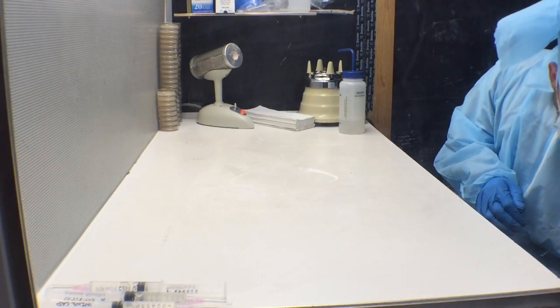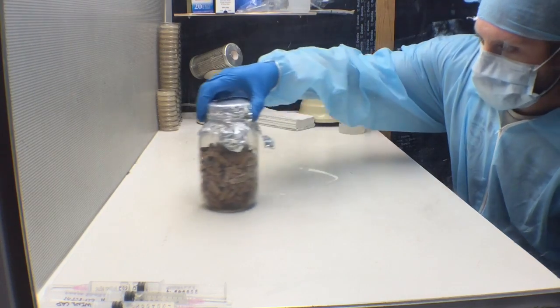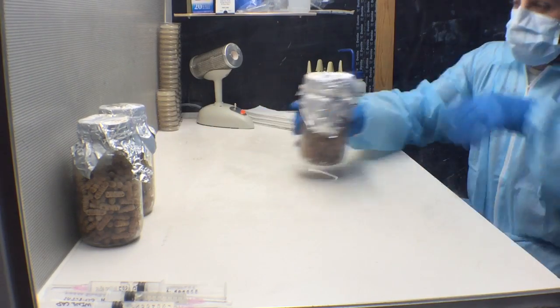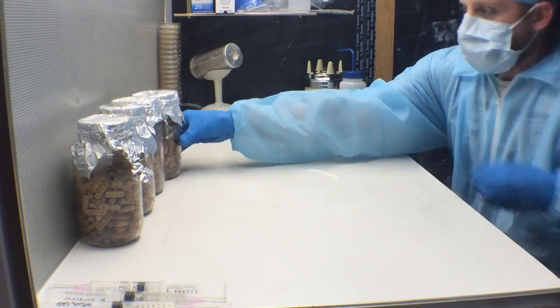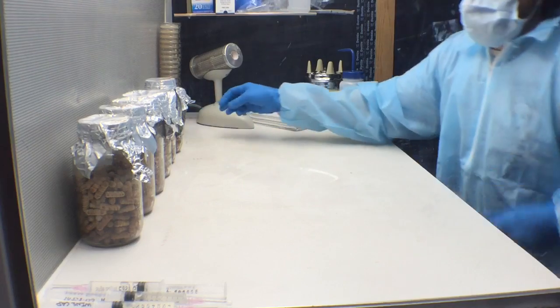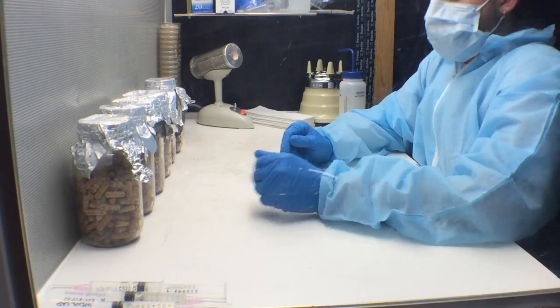Now that your workspace is sterile, you'll want to take your jars and line them up in front of your flow hood. Once your jars are lined up, remove the tin foil cap.